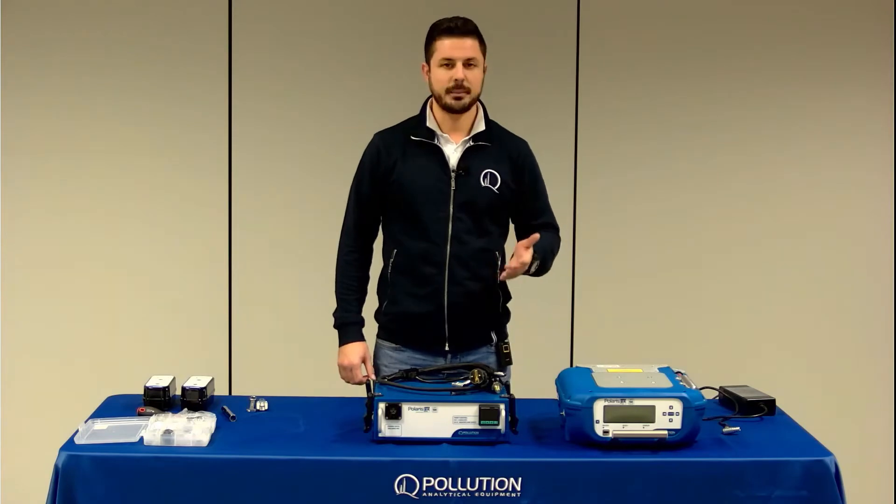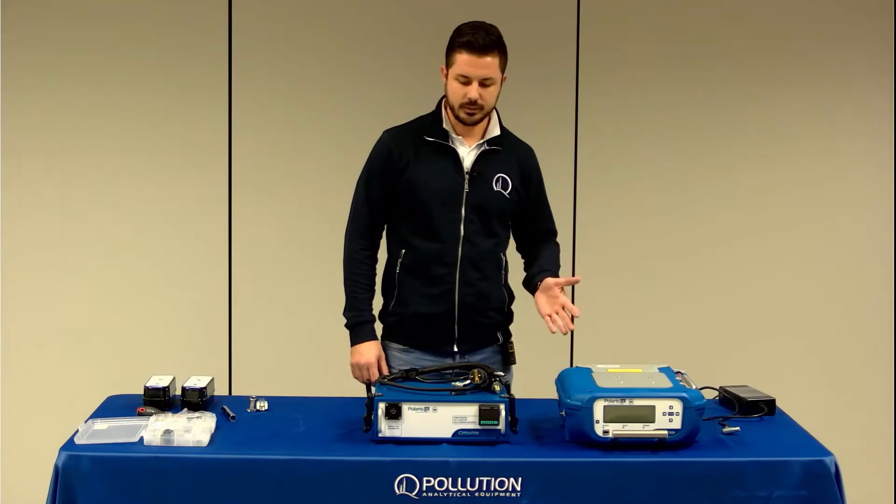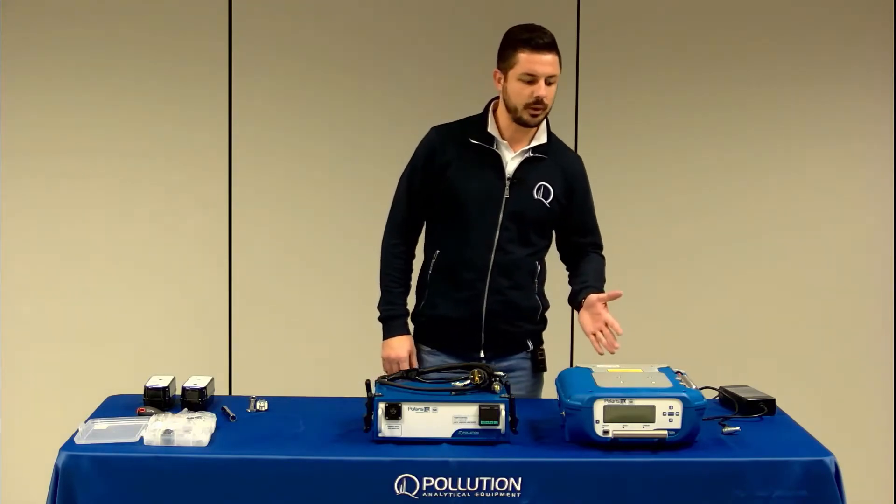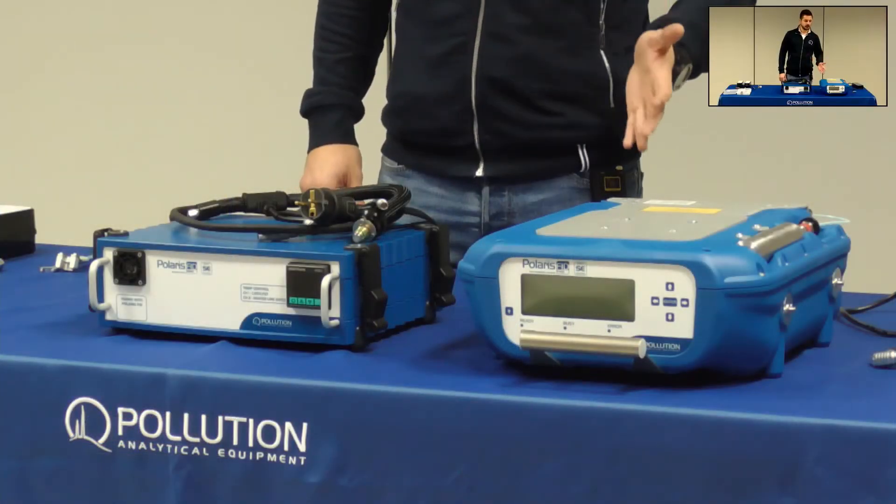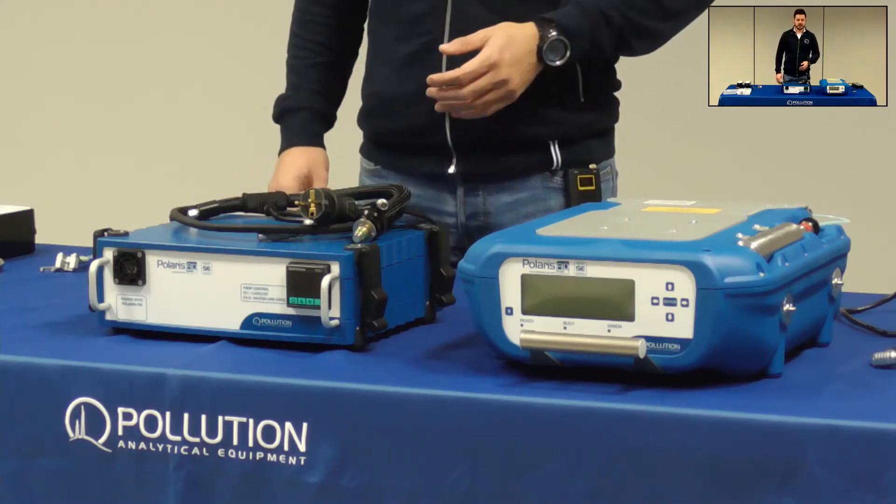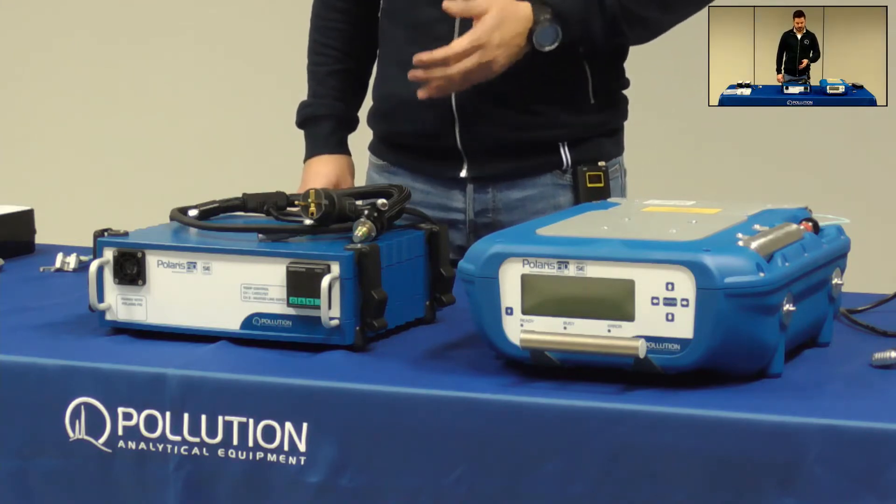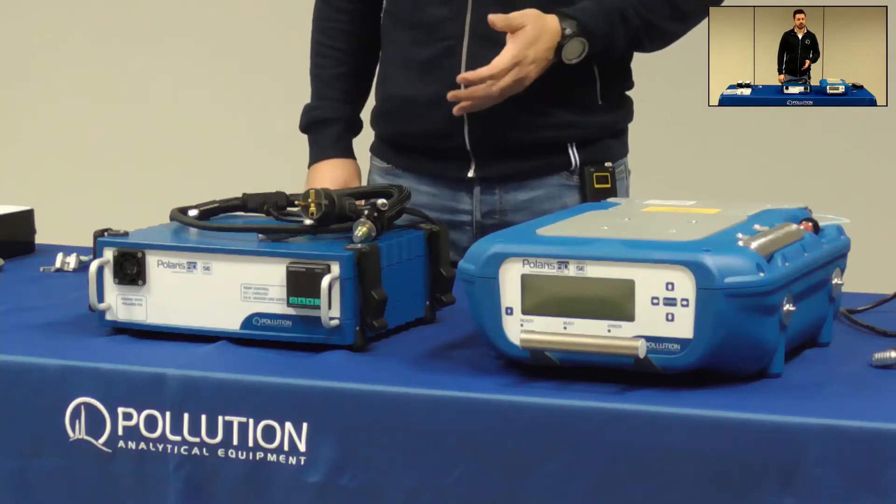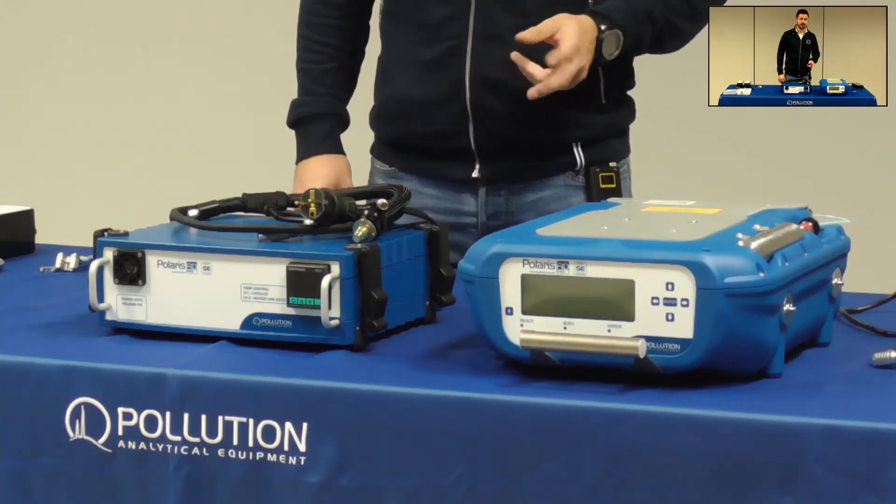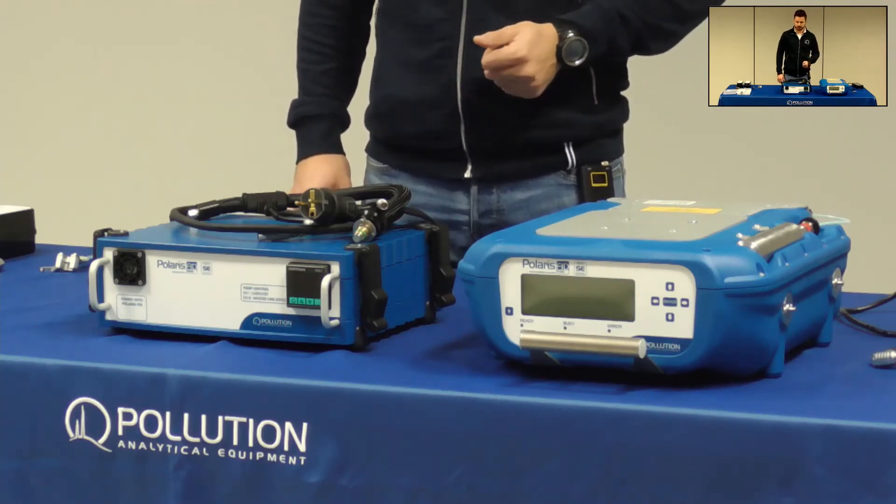The docking station will allow you to discriminate between methane and non-methane hydrocarbons, thanks to its internal oxidizing catalyst. The gas sample will enter the docking station and the catalyst will oxidize all VOCs but methane. So on the first run the FID will give you only the methane signal. On the second run the gas sample bypasses the catalyst and the FID will quantify the total VOCs. Polaris will automatically calculate the difference between methane and non-methane VOCs.